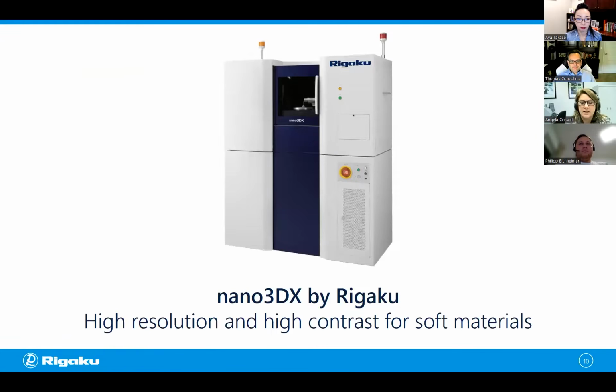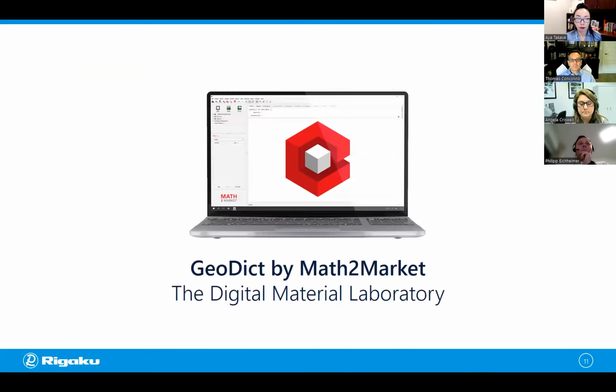Of course, just like in previous workshops, the data that you see today was collected by either Aya or myself. In particular, the fiber media were collected on the Nano 3DX. We chose that because it provides high resolution data and great contrast for soft materials like fiber media. We'll also be using the GeoDict software package from Math to Market in this workshop, as well as for the rest of the series. And Tom can give you a link to their website.